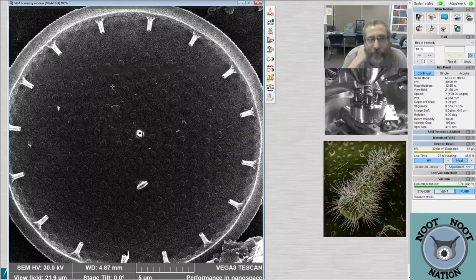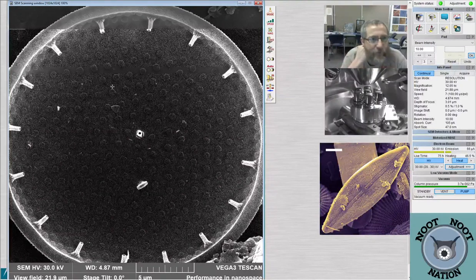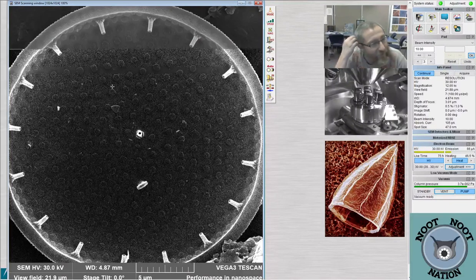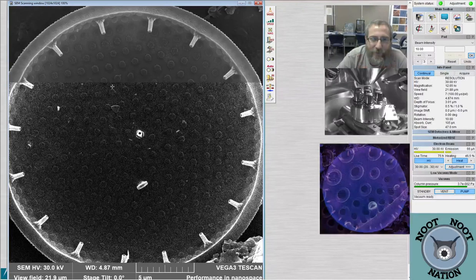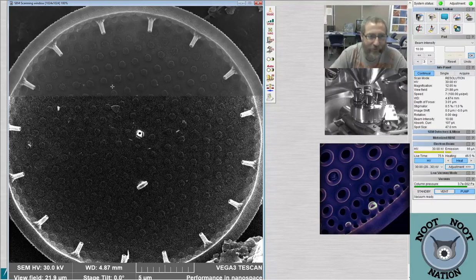Huh. I've never seen this in any of your other samples that you've sent me either. So that's another thing that leads me to think it's something different. I've never seen anything like this in your samples. Well, maybe it just made a mistake on where it stuck that one. Where it put the rimoportula? It was having a bad day. You'll remember that for Thalassiosira, on the outside, the rimoportula is associated with a big, long tube. And this one's lying flat, which means there's no tube associated with the rimoportula. So if it just put it in the wrong place, it should be sitting at a crazy angle. But this one's lying flat, which means it has no tube associated with the rimoportula at all.